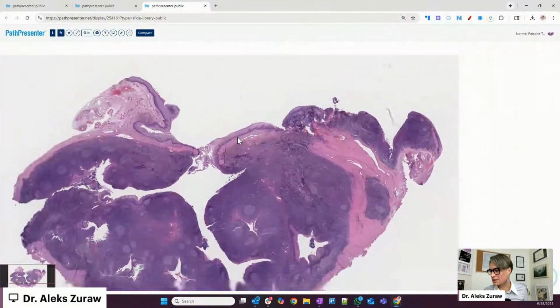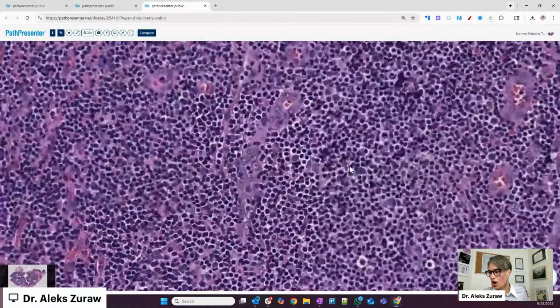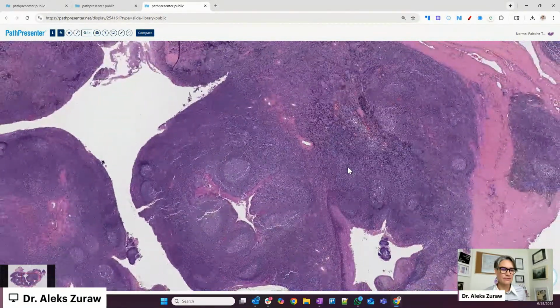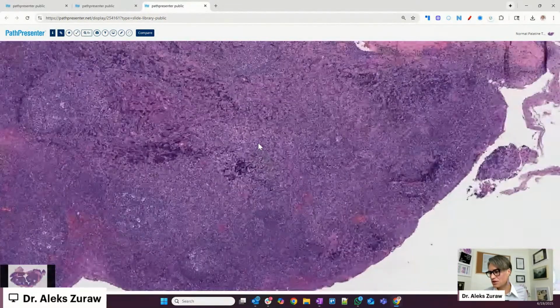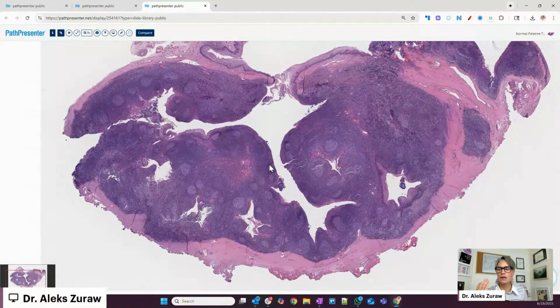Because most of this tissue, you can see that it's pretty homogeneous from far away, dark, and when you go in, a lot of dark dots. These are lymphocytes. These are immune cells that sit there to protect us from outside danger, from pathogens, but also to present antigens from everything that's entering our system from the outside. These cells are gonna defend us.